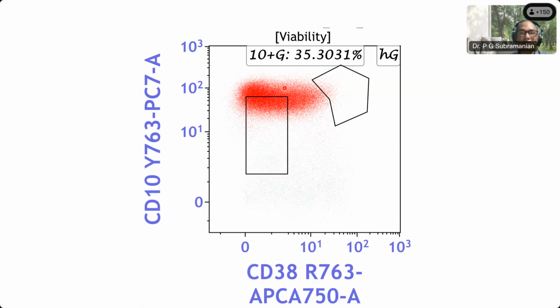So earlier there was a confusion, B-ALL or not. So absence of CD38 is also one of the important LAIPs, or leukemia associated phenotypes. Underexpression or absence of CD38 is a leukemia associated phenotype. The reason is, in normal hematogones, the CD38 always falls here. They never go down. But in mature B cells, CD38 will be negative. But in hematogones, CD38 will always be here. Hematogones are maturing B cells, that is, from blast to mature B cell, that region is taken up by hematogones.